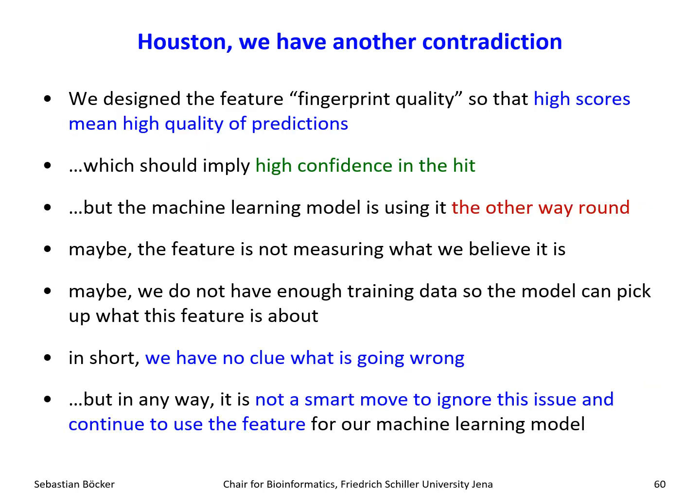And there's more. For example, the confidence score is also depending, as I said, on the prediction quality of our fingerprint. So we made up a measure of the prediction quality where we again believed we made it so that a high value tells us our machine learning system has high confidence in the quality of the fingerprint, and a low value means it has lower confidence in the quality of the fingerprint.